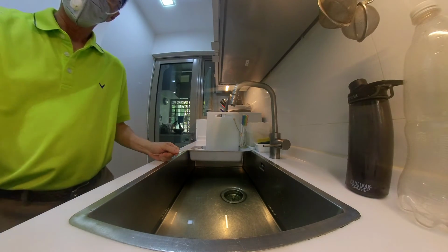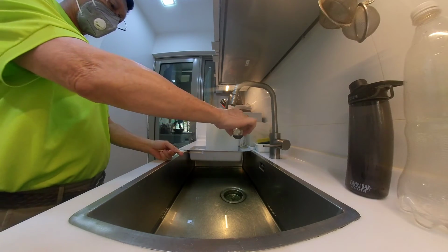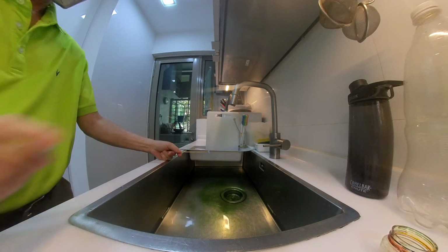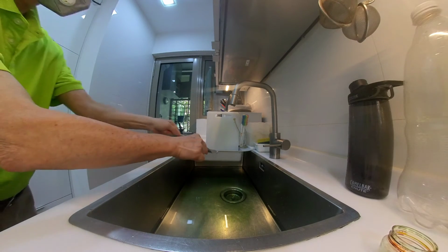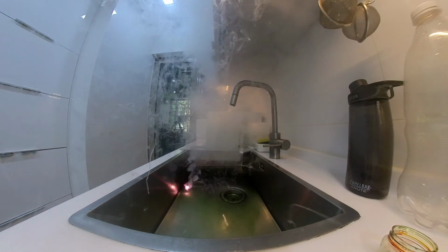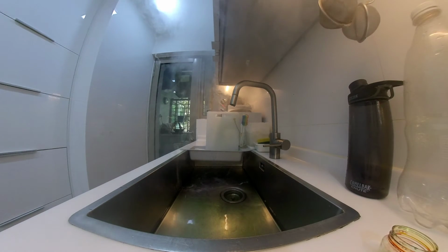First, we will pour some UI inside, and UI is green. Okay, so now we put it inside here. Is the camera okay? The camera is okay.